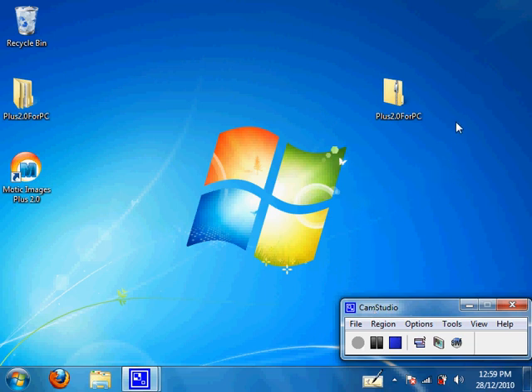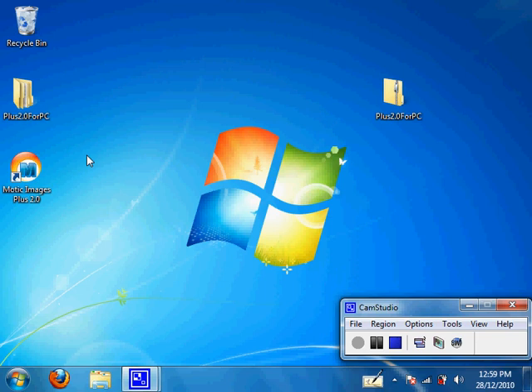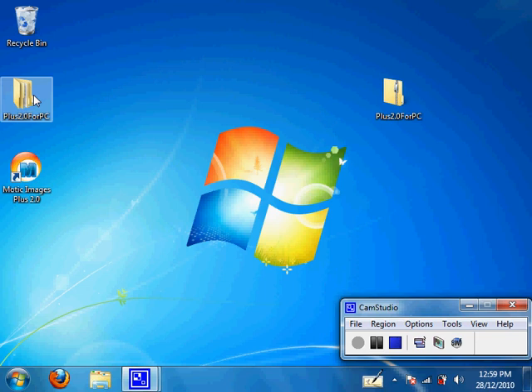Once you have downloaded the software as a zip folder, please extract it into your desktop plus 2.0 for PC. The driver that we will need to manually install is inside that software. This will also apply to Motec Play or Motec Educator.